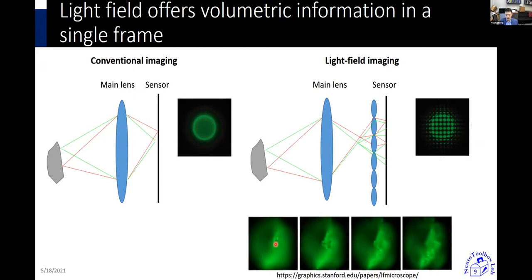So in this case, one computational depth can focus at the top, which is this little region here, whereas another computational depth can focus on this region far away from the top of the sample.